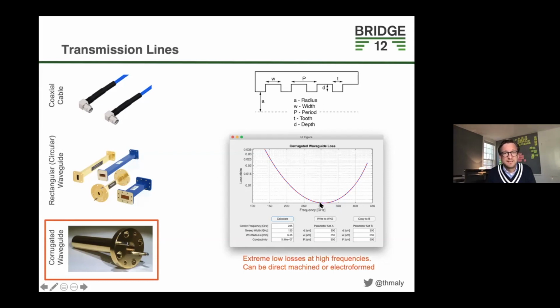And the thing is, these waveguides come out of plasma fusion technology, and they're typically much bigger. So they're like 60, 70 millimeters in diameter. Because if you're sending like a megawatt of microwave power through this, if you lose 0.001 dB somewhere in a miter bend where you go 90 degrees, that stuff gets hot. However, if you're using a 50-watt gyrotron, then anything below 0.01 dB is not really a concern anymore for losses. And there are many other areas, with alignment or coupling to the sample, where you have much higher losses than the straight sections of the waveguide.